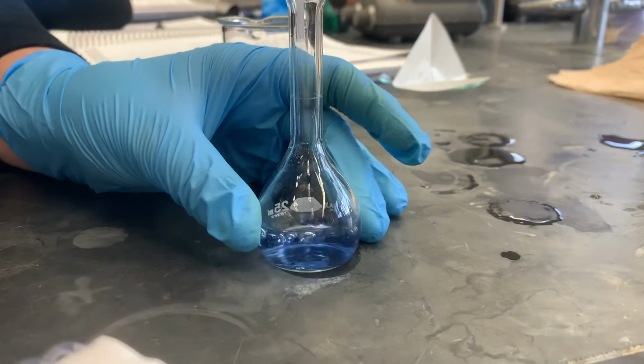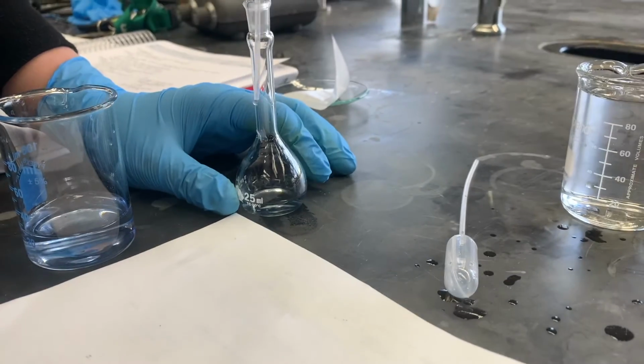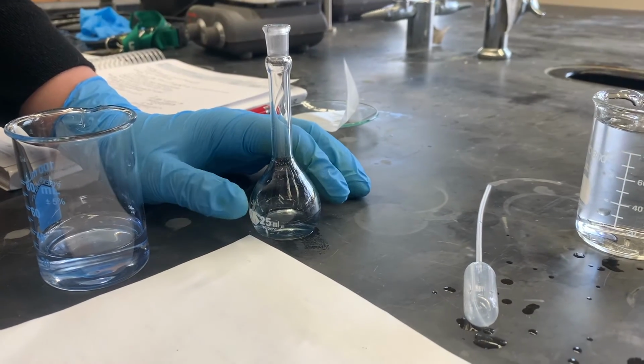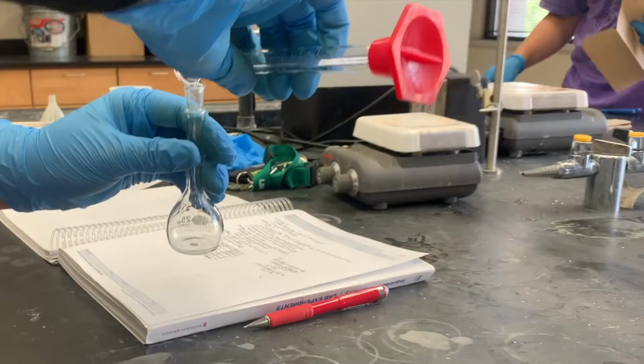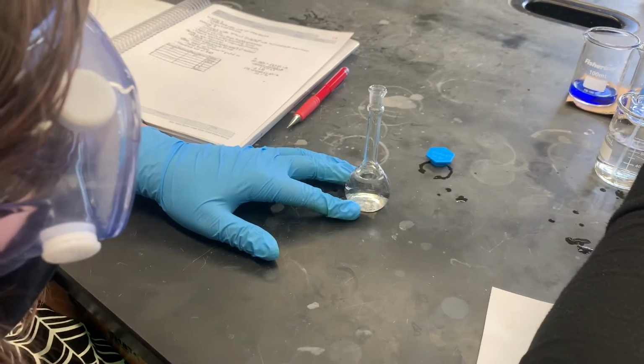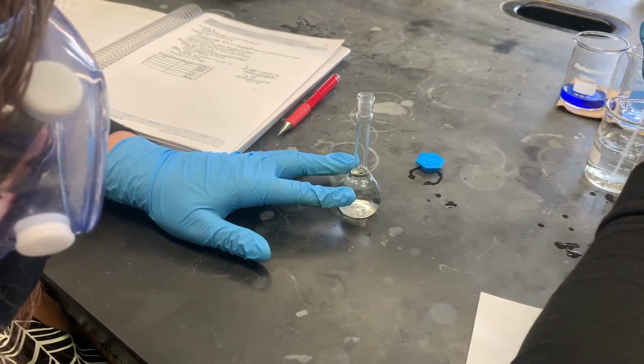water to the mark. For the second solution, we take 2.5 milliliters from the first diluted solution and add that to a 25 milliliter volumetric flask and carefully add water to the mark. For the final and third solution, we take 2.5 milliliters from the second solution, transfer it to the 25 milliliter volumetric flask, and add water to the mark.